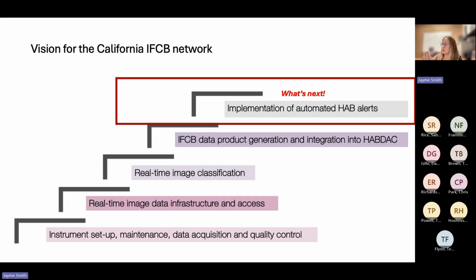There are challenges with marine HABs, just like there are with freshwater, where, for example, an actual count, especially for something like Pseudo-nitzschia, which I should have shown you a picture of. I need to not assume that everybody knows what that looks like, but it's a chain forming organism.